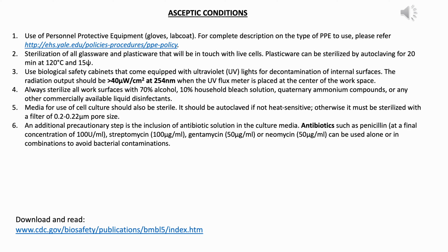And cells should only be opened up within the biological safety cabinet, okay, where the airflow filters are essentially on, and they are blowing out. So there is no inward flow of air, but outward flow only. All the work surfaces have to be wiped with 70% ethanol or any other commercial disinfectant. You can read more about this at the CDC website that is enclosed here. There's a free booklet available there that you can download, and it details all the aseptic techniques one can follow. For more details about PPE equipment, you can also check the website at Yale.